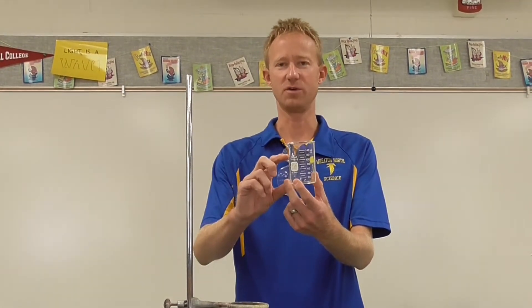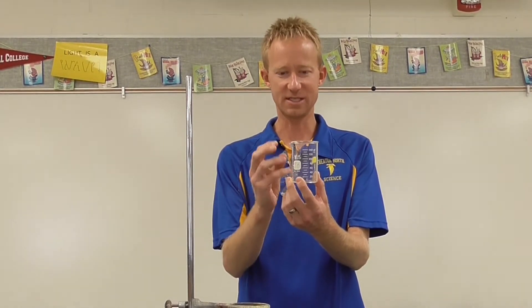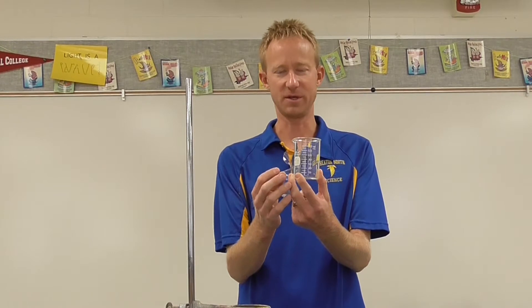In this video, I'm going to be demonstrating how to perform a proper filtration. Let's say for instance you had a beaker with a mixture inside, and the mixture had a liquid component and a solid component, and you wanted to separate the liquid component from the solid component.